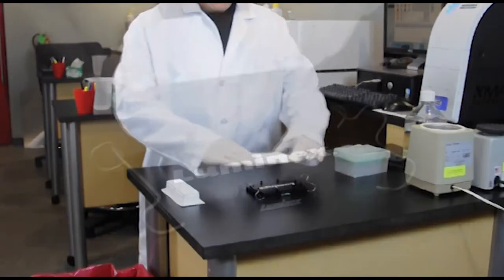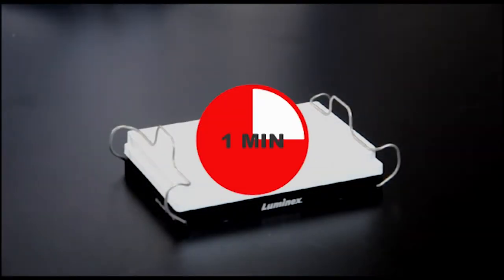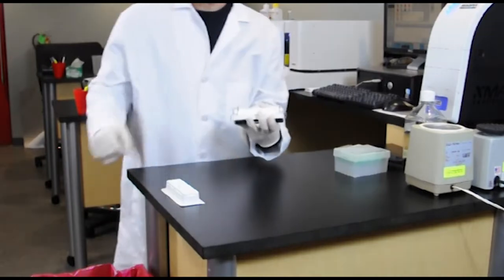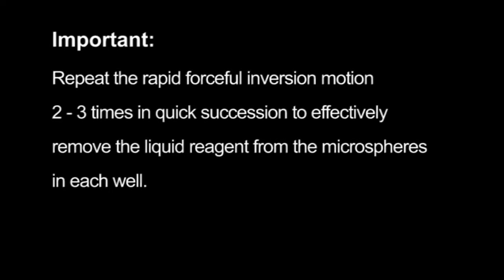At the end of an assay incubation step, place the assay plate on the Luminex Magnetic Plate Separator for one minute to bring all of the MagPlex Microspheres to the bottom of each well. Clip the 96-well plate to the separator, then grasp the plate and the Magnetic Plate Separator securely in one hand and rapidly and forcefully invert them over a sink or biohazard receptacle to evacuate the liquid reagent from the wells. Repeat the rapid forceful inversion motion two to three times in quick succession to effectively remove the liquid reagent from the microspheres in each well.